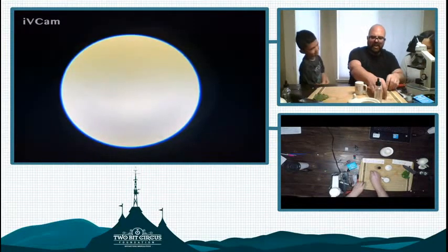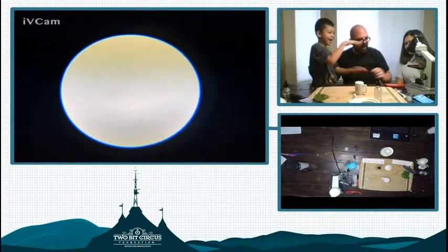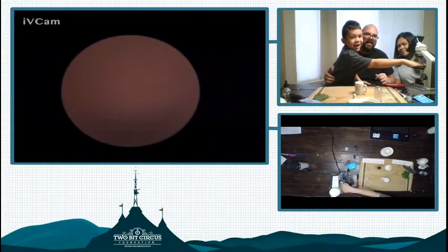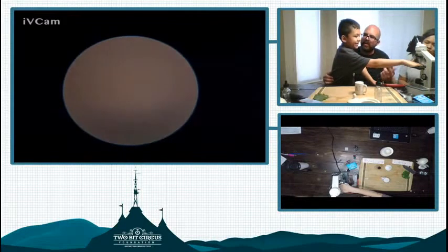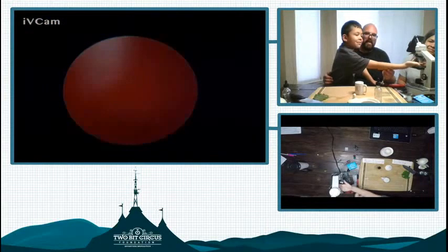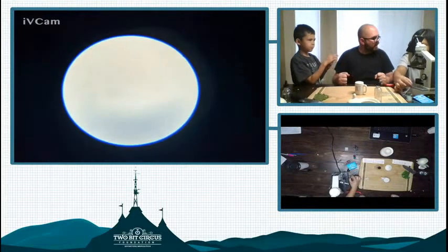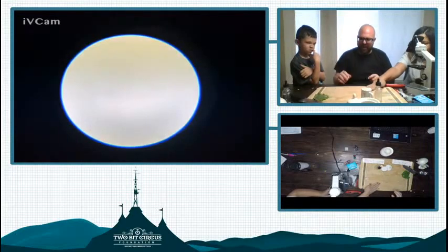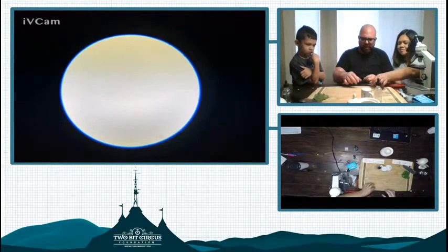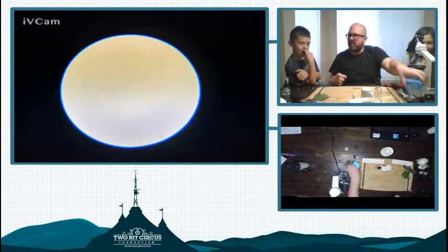Now, the biggest one we're going to check right now is this sample. We're trying to find a way that we could put Robert on a slide. So, Robert's putting his hand under the microscope right now. I don't think your hand allowed light to go through it, so I don't think that microscope is going to work for that. Maybe if we had a stereo microscope, right? I always get them confused and I'm thinking quickly right now. I want to make sure.